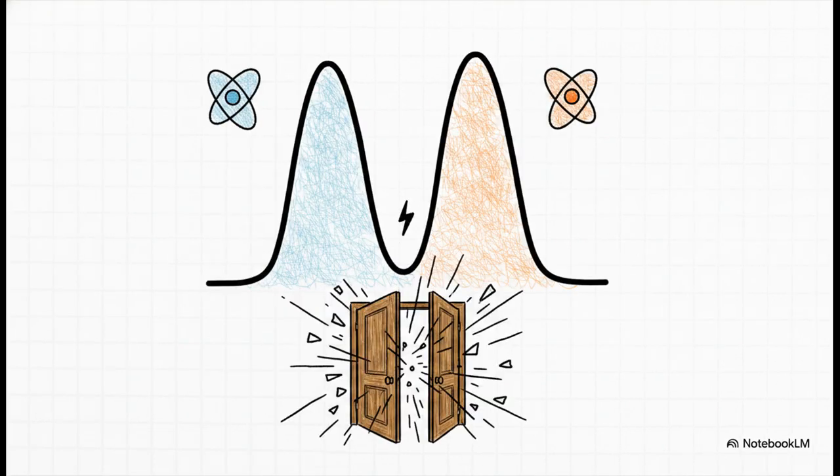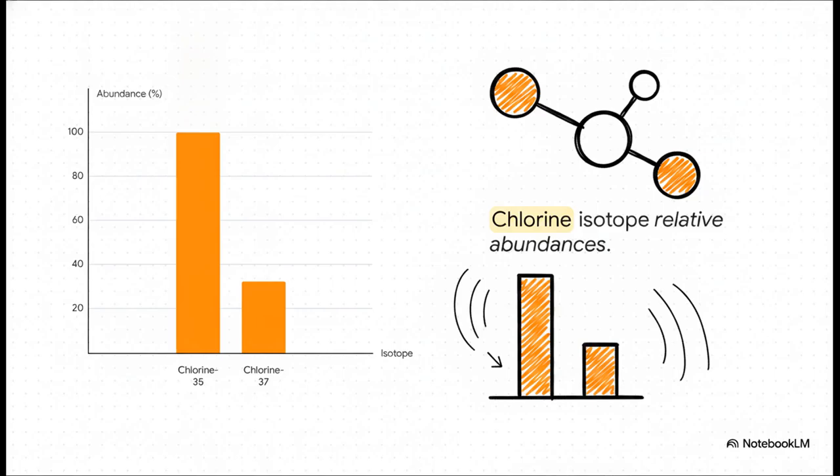Okay, now let's dive into the most dramatic isotopic fingerprints of them all, the halogens. While carbon and sulfur leave these tiny, subtle little peaks, chlorine and bromine, they absolutely kick the door down. They create massive, unmistakable M+2 signals in a mass spectrum that are virtually impossible to miss. Chemists affectionately refer to these as the halogen doublets. Take chlorine, for example.